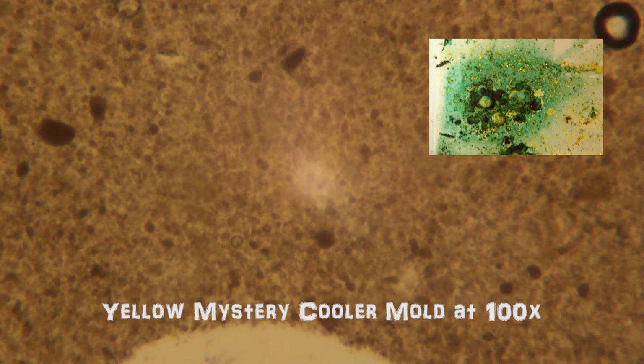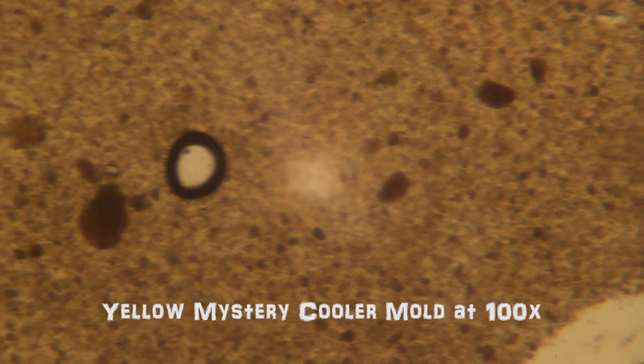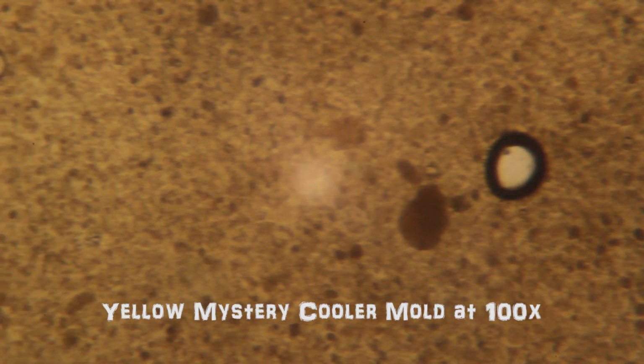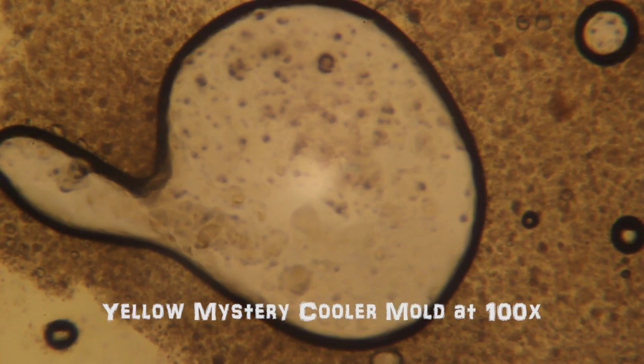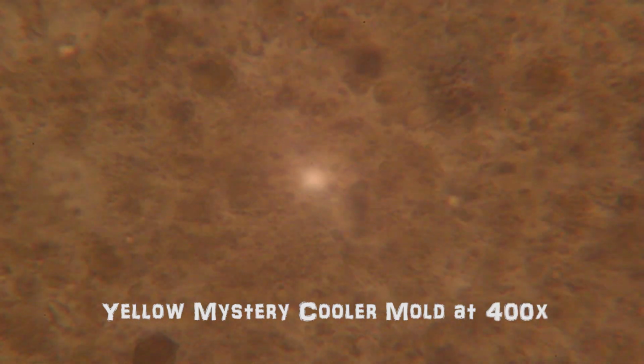All right, I'll go ahead and switch over to 100 times magnification here and get that picture out of the corner. You might notice some air bubbles, like right there. That is actually caused from air being trapped under the cover glass. It's not part of the actual specimen. And this yellow stuff is more of a liquid than the green stuff that we'll see a little later. Let's switch over to 400. Here it is at 400 times magnification.